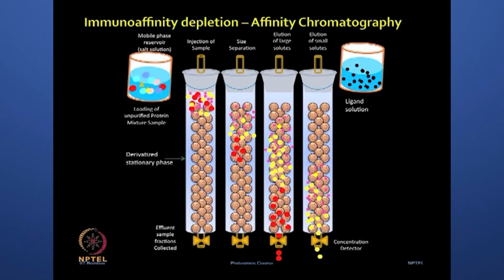To eliminate those highly abundant proteins, the authors used the multiple affinity removal system from Agilent Technologies, and they removed the most highly abundant proteins from the serum sample, including albumin, IgG, antitrypsin, IgA, transferrin and haptoglobin. After the abundant proteins were depleted from the serum sample, the authors moved on to protein extraction and further analysis.